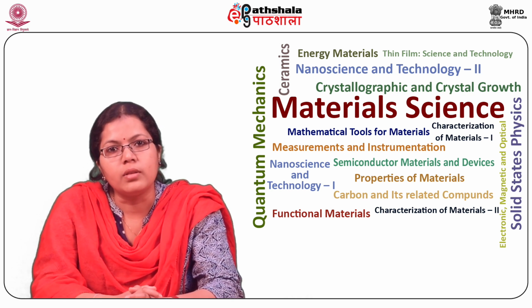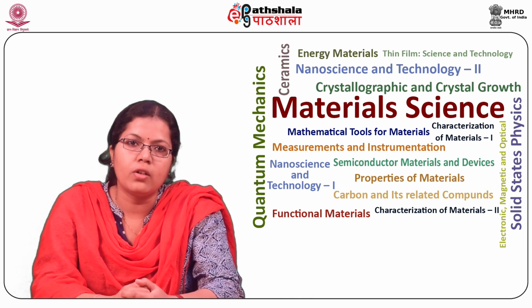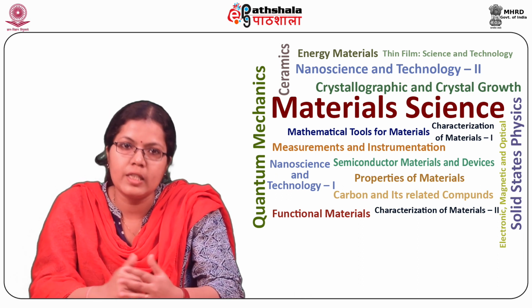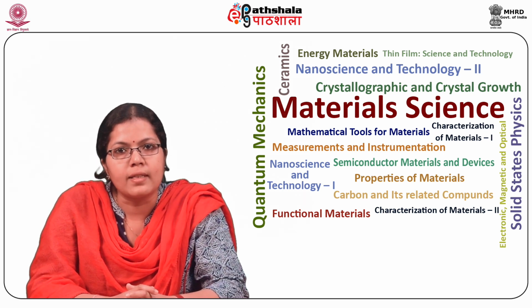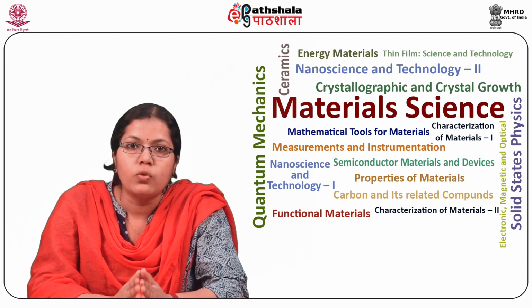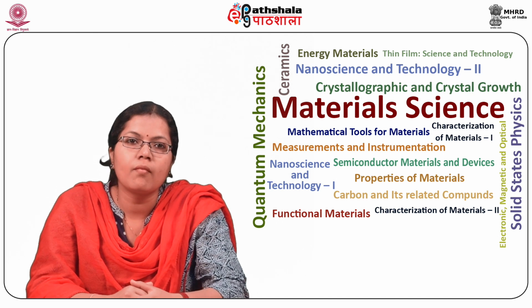It is also possible to heat, cool, or strain the sample while under observation, that is, heating, cooling, and straining stages. The functions of the lenses are: first, of the condenser lens, to control beam intensity, density, and convergence.